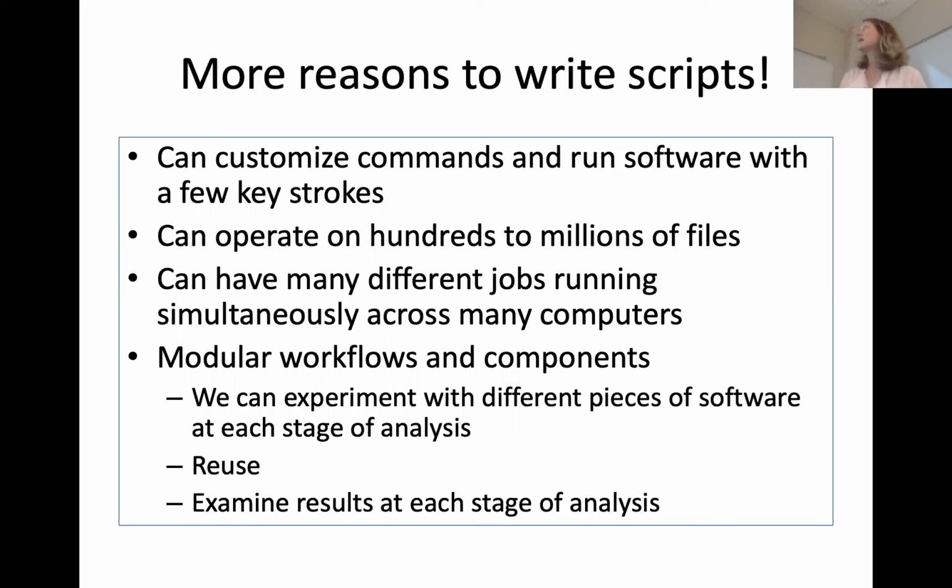You can customize commands and run software with a few keystrokes. So let's say you want to try to run STAR, but then you want to add a different flag. Well, you can just go back in and edit your text file, add that flag, and rerun it. You don't have to type all of the other flags and all of the other stuff that you had to type the first time. You just want to tweak one parameter. You tried it with one parameter, you don't like it, you want to tweak it. So it makes it a lot easier to do that.